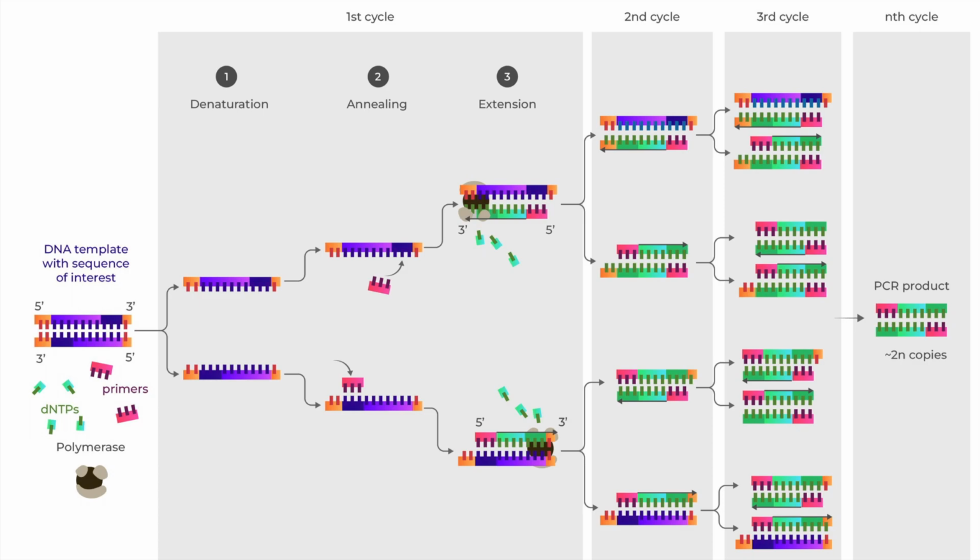In this video, we will show you how to simulate polymerase chain reaction, PCR, on Mendelgen. PCR, through the use of a DNA template, primers, dNTPs, and a DNA polymerase, exponentially amplifies a specific region of DNA. This is done by running many cycles of a three-step process, each cycle doubling the amount of DNA in the previous cycle. The steps in each cycle are as follows.